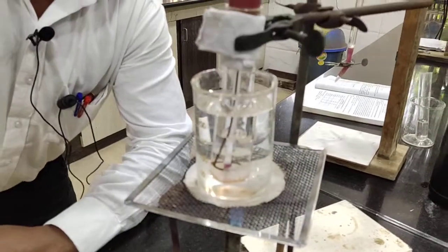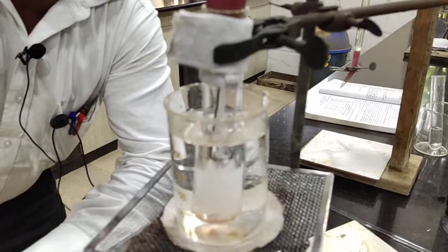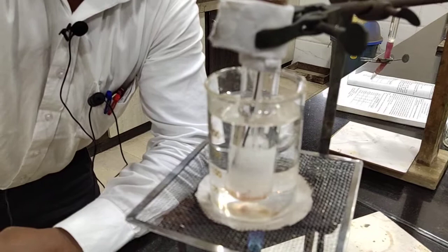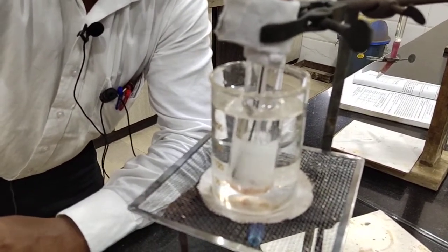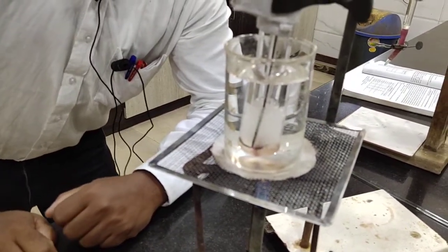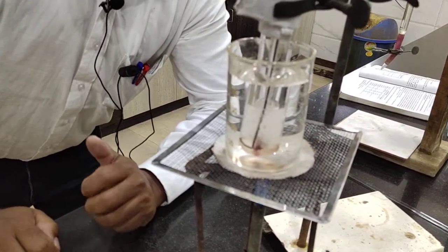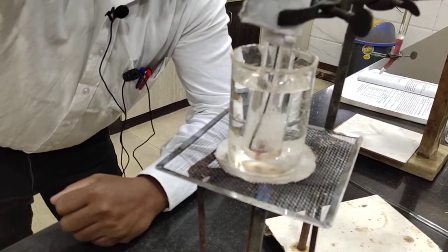Okay, so while heating, we have to continuously stir the mixture. Why are we going to stir the mixture? Because we want a homogeneous temperature in all portions of the system. So we are going to heat it and stir it. While stirring also, we focus on the temperature, because we have to measure the temperature at which both liquids mix in each other and it will become a clear solution.